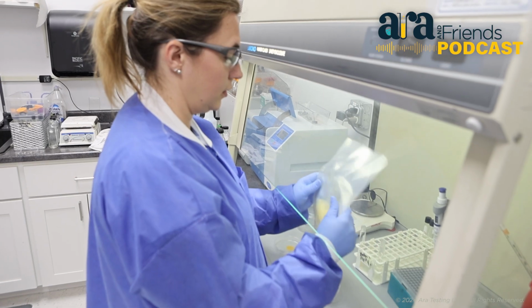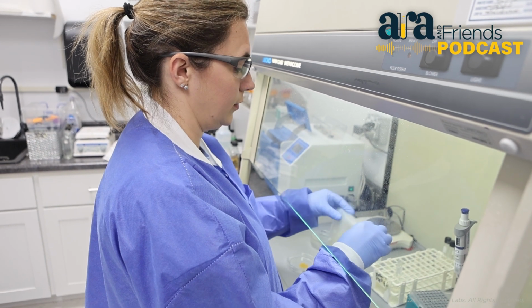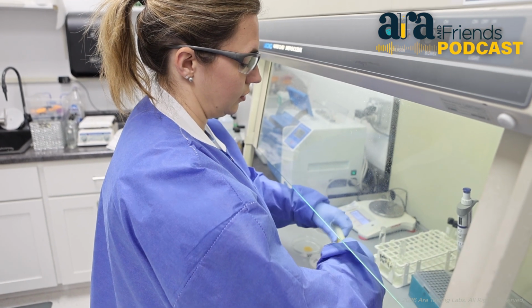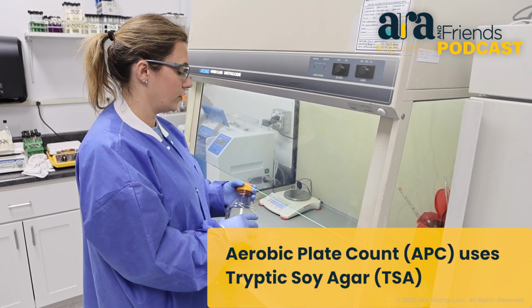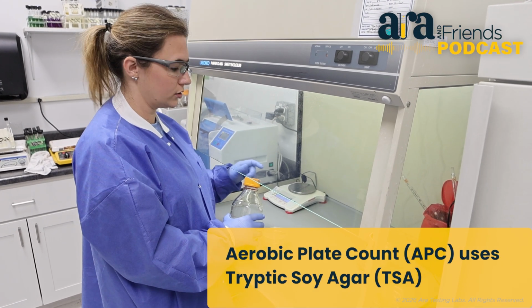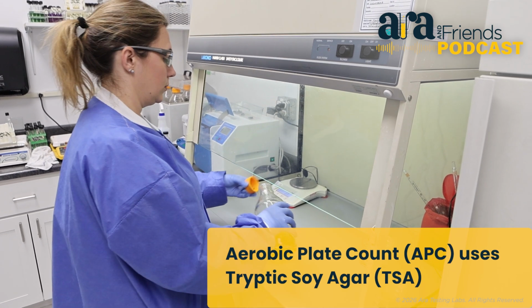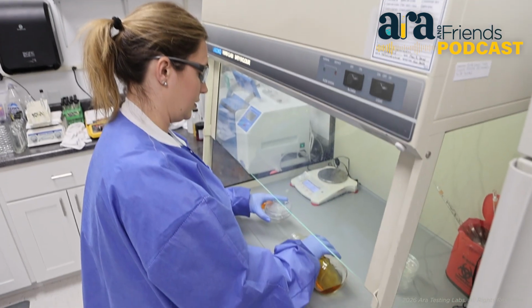And then our sample bag, the stomacher bag, will be clipped and put into the incubator overnight to proceed to the test tomorrow as E. coli, salm, staph. We're going to pour our agar for the USP method for aerobic plate count, which is TSA, tryptic soy agar. So we'll pour our sterility and our samples and swirl them and let them solidify before putting them into the incubator.